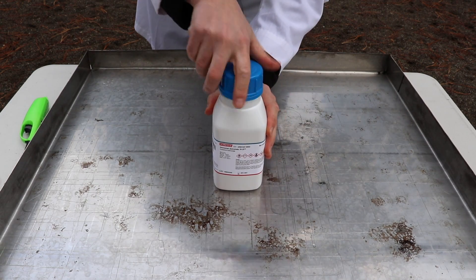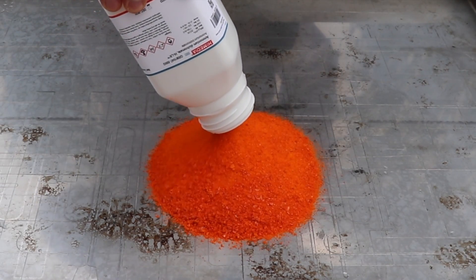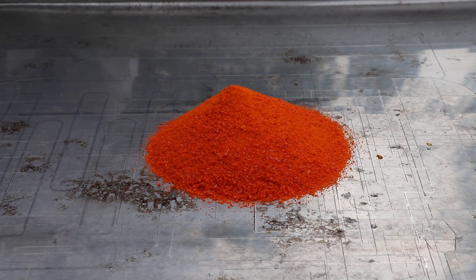Okay, let's pour the chemical on this tray. Just trying to make like a little hill like that. Now I'm going to set this thing on fire and see what happens.